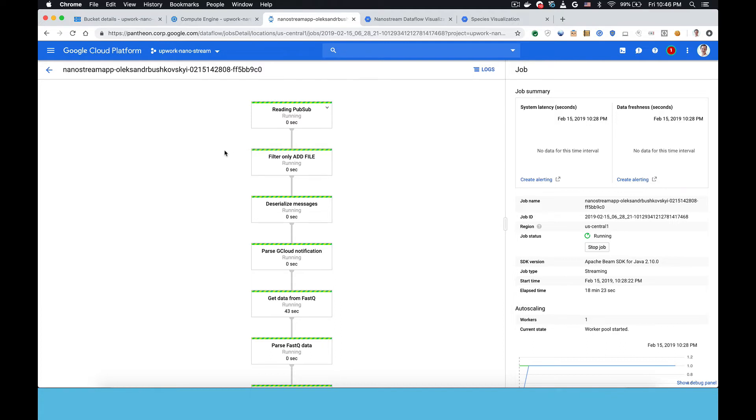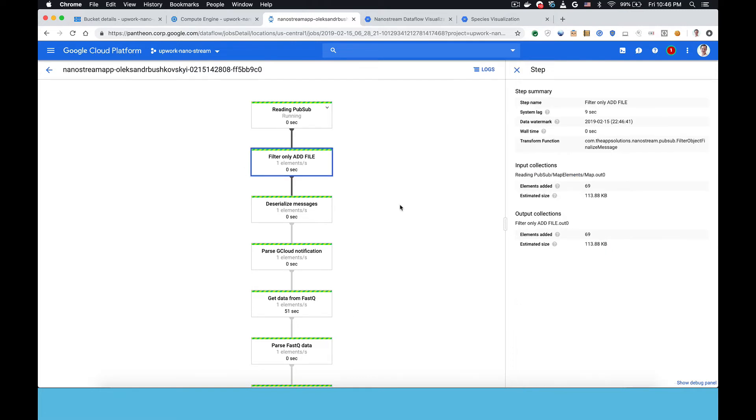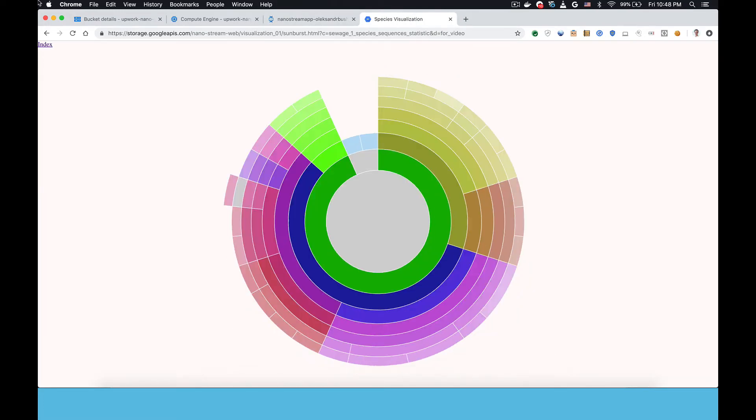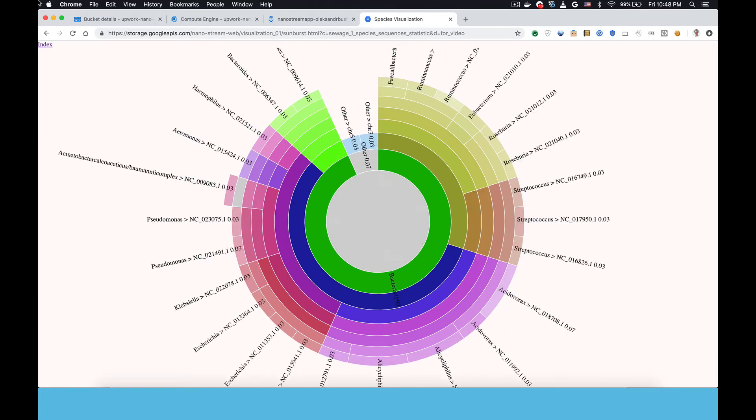Now I'm showing the visualization of the Apache Beam data flow that's running. So you can see it's reading from PubSub queue looking for added files and that files are coming in 69, 87, etc. The data are live and the visualization now is beginning to populate. So they're just updated.